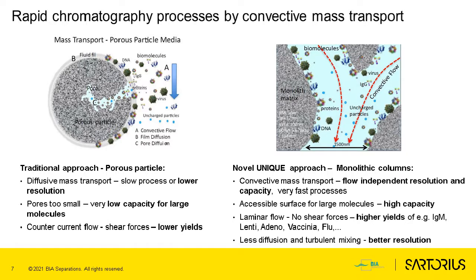Other than that, this is just chromatography resin, so any ligand you can imagine on porous particles, you can also realize on the monolith, from cation exchangers to anion exchangers, hydrophobic interactions, affinity interactions, and so on.